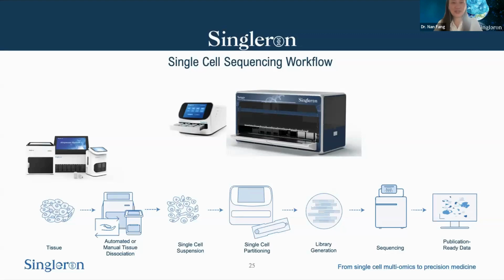We actually don't discriminate against any species, because the technology itself only relies on the poly-A tail of mRNA from any eukaryotic cell. The oligo-dT on our cell barcoding beads will capture the poly-A parts of any mRNA, no matter which species it is.